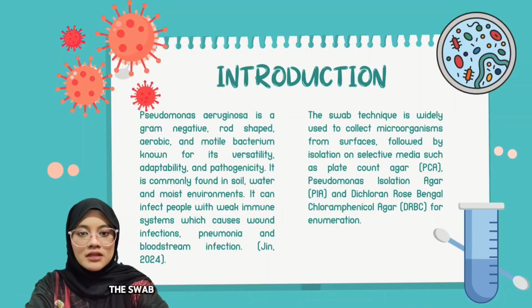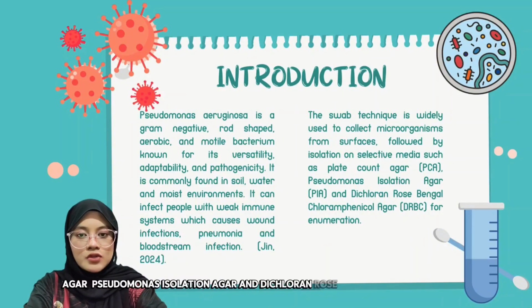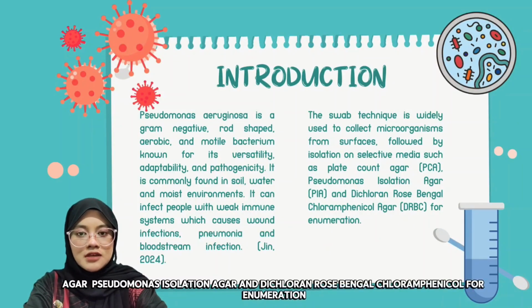This swab technique is widely used to collect microorganisms from surface, followed by isolation on selective media, such as plate count agar (PCA), Pseudomonas isolation agar (PIA), and dichloran rose bengal chloramphenicol agar (DRBC) for enumeration.